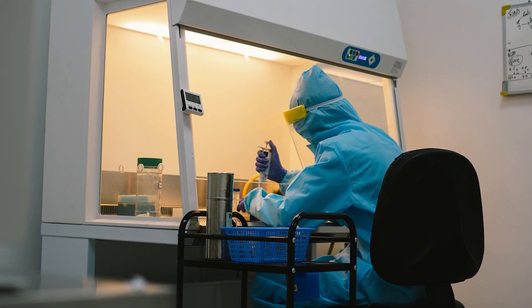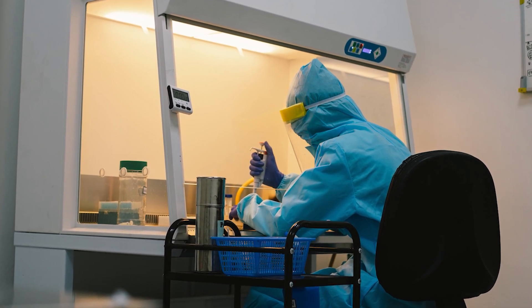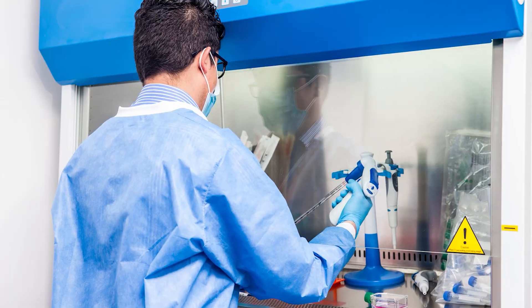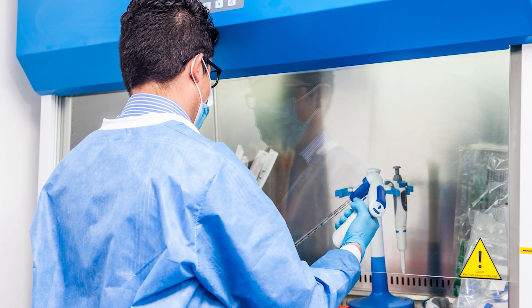The fume hood operates by maintaining a relatively negative pressure inside the hood to prevent contaminants from escaping, while consistently drawing air through the hood opening. Different types of fume hoods offer specialized protection for various lab applications.